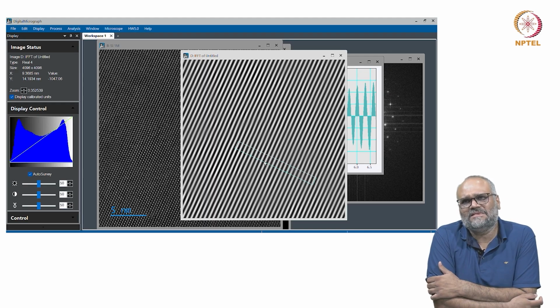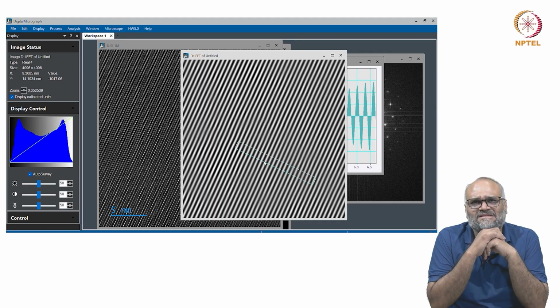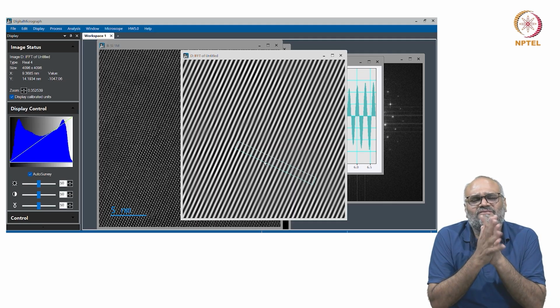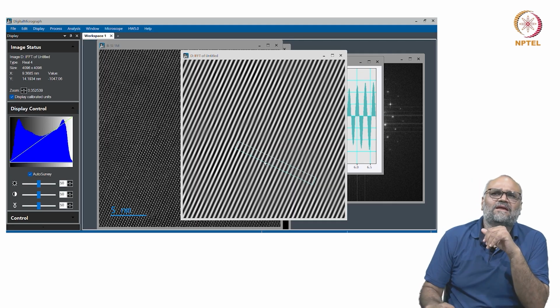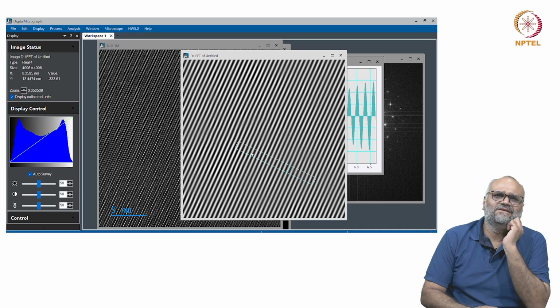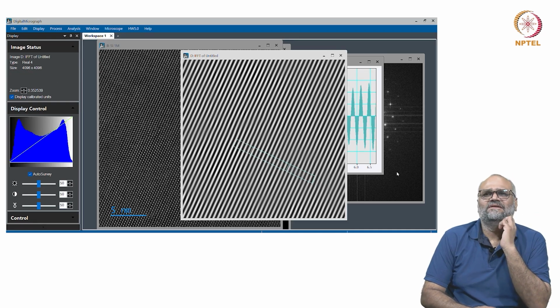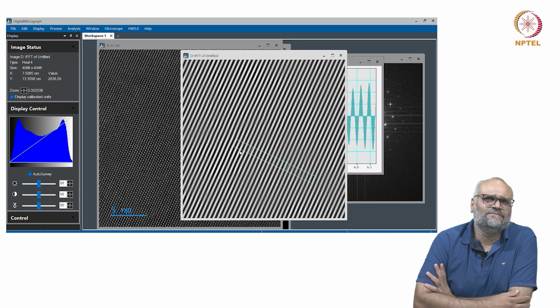So there is of course a problem in such high resolution images if they are typically not from a corrected microscope. You have a delocalization problem, and when I'm applying a mask like this and measuring the planes here, you would certainly have some kind of delocalization effect, and there would be some slight shifts or spread here.